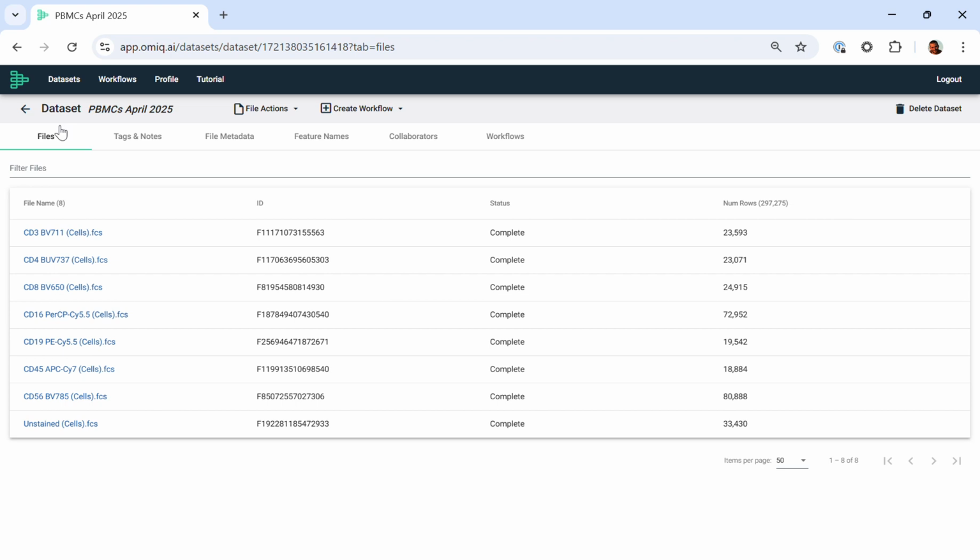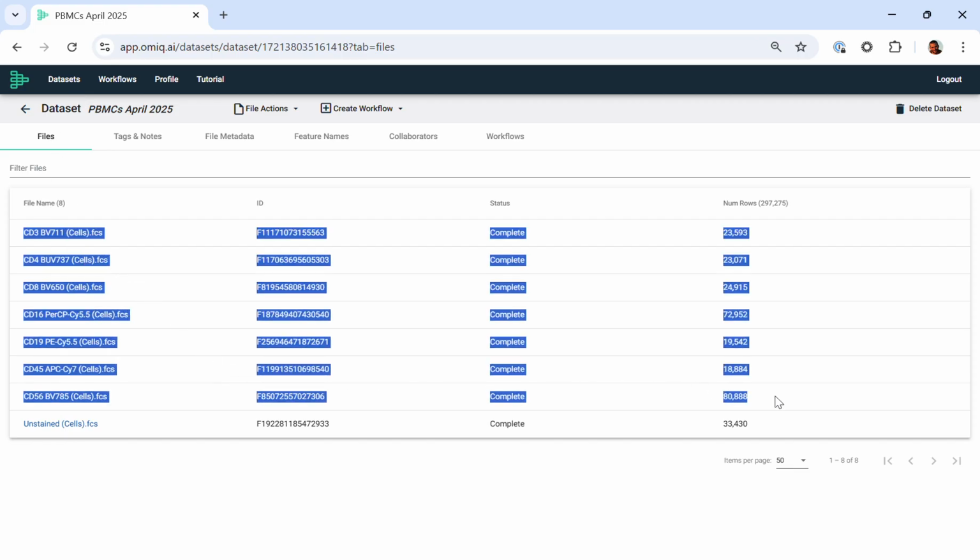Hi all, my name is Omar and this is a short video tutorial about the OMIQ, EasyPanel integration, allowing for two things. One, the QC or QA or validation of your different spectral signatures on any spectral cytometer, essentially comparing your data empirically or experimentally generated versus the reference that we have in EasyPanel, or the one that you have set or that your flow core manager has set as benchmark. We'll talk about that in a second.